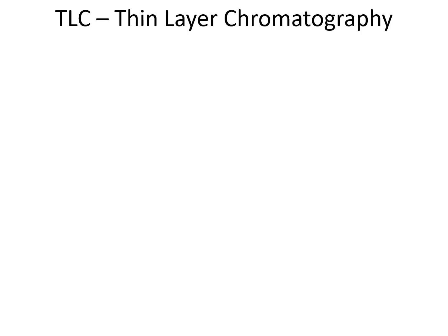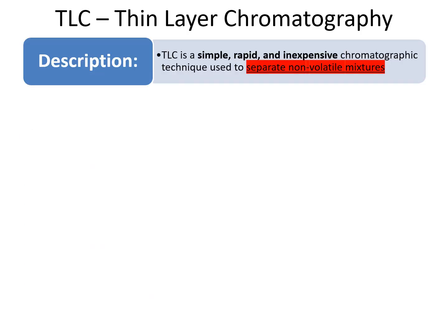This technique is one of the simplest, rapid, and inexpensive chromatographic techniques that is used to separate non-volatile mixtures over a solid adsorbent stationary phase, usually aided by a liquid solvent called mobile phase that moves the analyte through the stationary phase by capillary action, leading to separation of the components along the stationary phase.